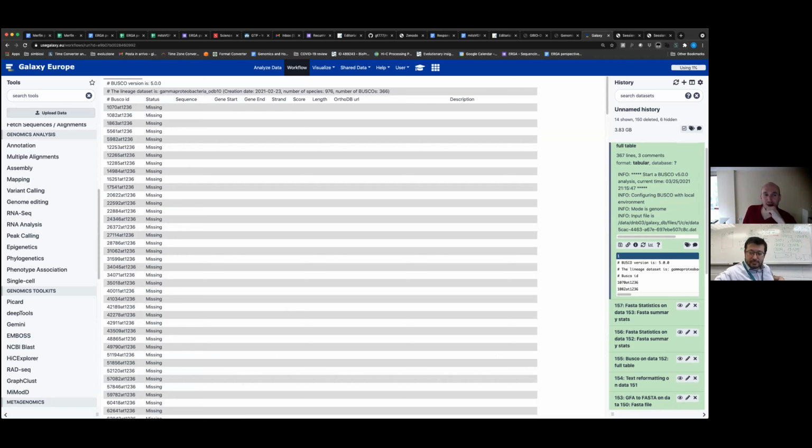So in this pipeline, there is nothing that provides the QV. But we have asked Galaxy to actually implement it, so we're working on it. So it's just that Galaxy doesn't yet have that as an option. Yes, we didn't run it. We have to integrate the tool for that.